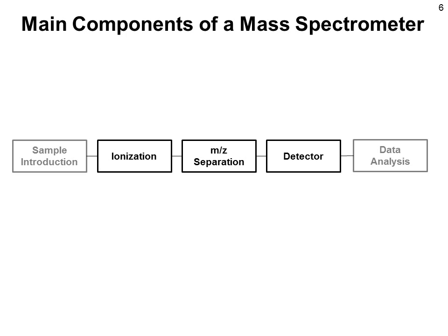Then ions must be formed, because mass spectrometers can only work with molecules that are ionized. These ions must be in the gas phase and then transported into the high vacuum region of the mass analyzer. The mass analyzer performs the m/z separation, the separation of the ions according to their mass-to-charge ratio. Finally, we must detect the ions that have been separated. So the ions will hit a detector and generate an electric signal that is measured. This signal should be proportional to the number of ions. It's kind of an ion counter.